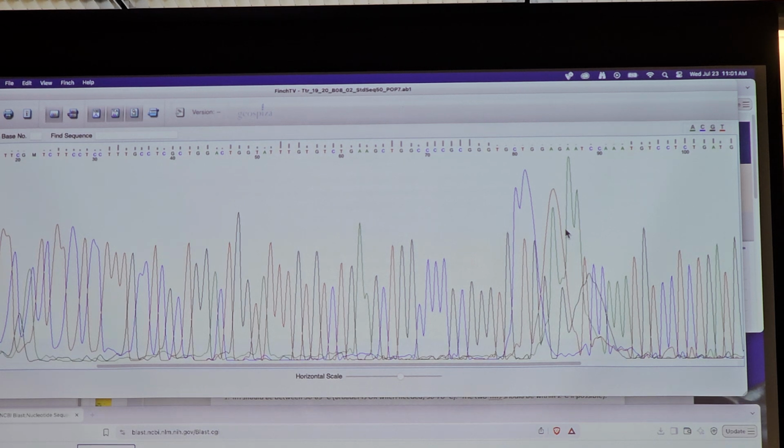But it's a slow process. That's why I say when you look up sequences, if you see something that's pre-2000, you want to be a little skeptical maybe. After 2000, things improved a lot. Okay?